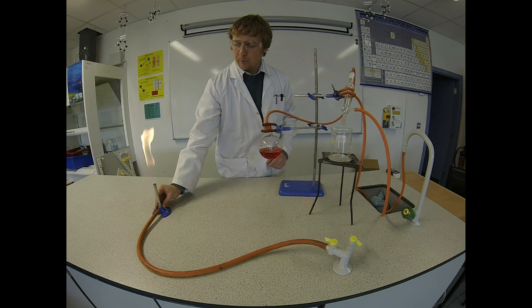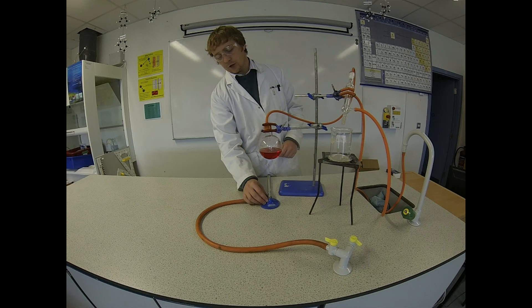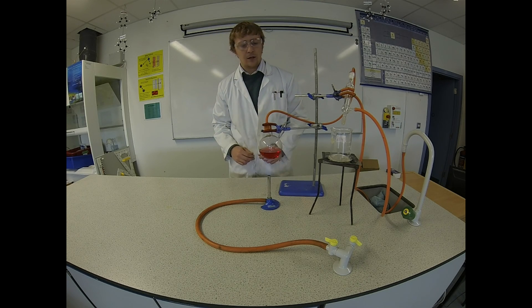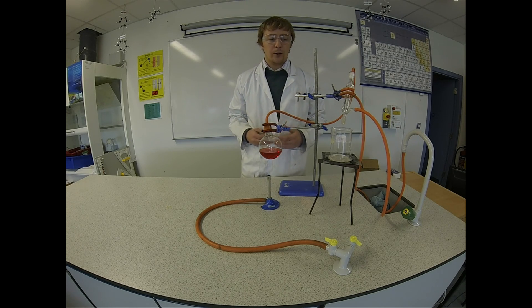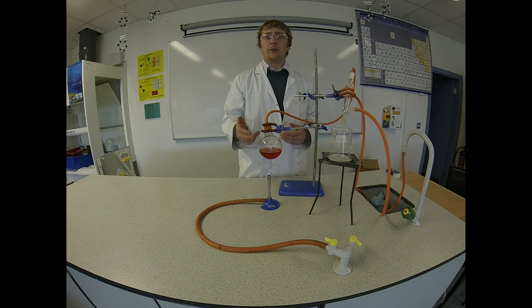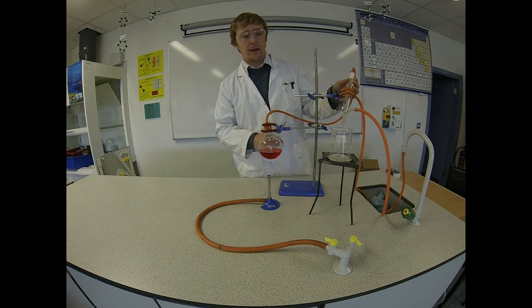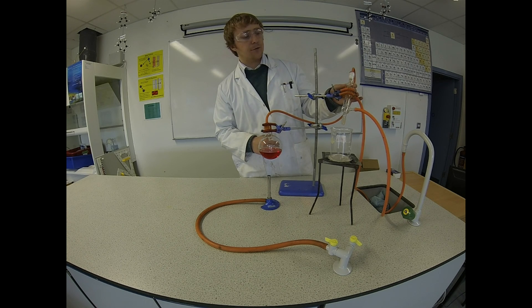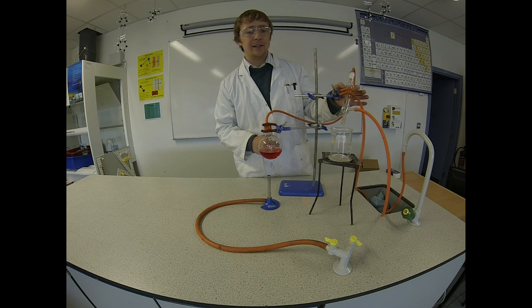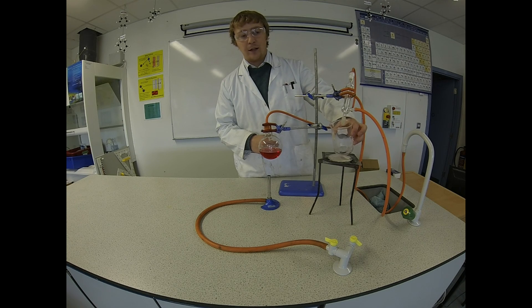Next I'll turn on the blue flame and start heating up my mixture. As the salt and water mixture heats and boils, the water is going to evaporate and come out through this tube here into my Leibig condenser. The cold water flowing through the Leibig condenser will cool down the steam and condense it back into liquid water, which we'll collect in this jar.